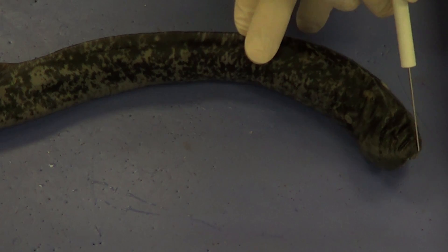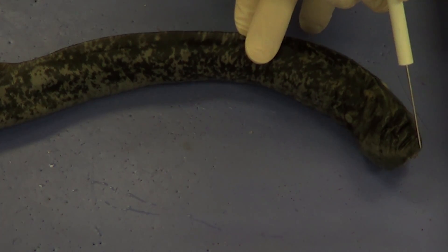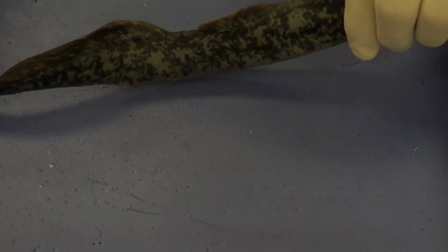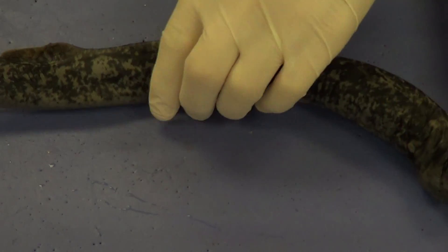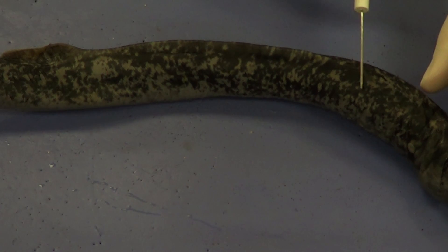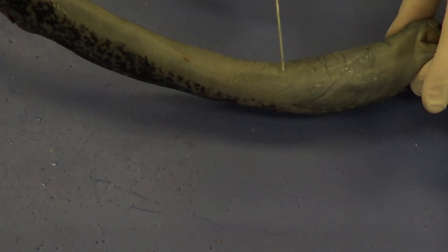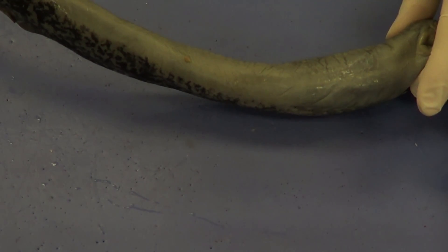This would be the anterior aspect of the lamprey, and this is going to be the posterior aspect, towards the tail. The back part of the lamprey is going to be the dorsal aspect, and the belly part of the lamprey is going to be the ventral aspect.